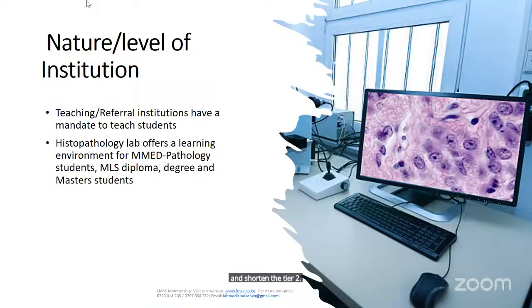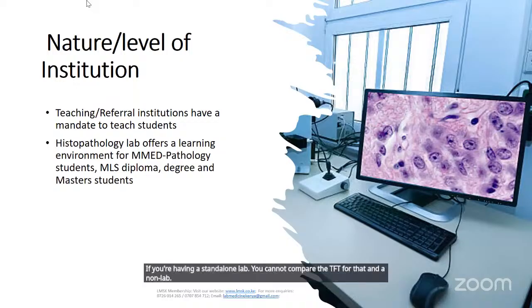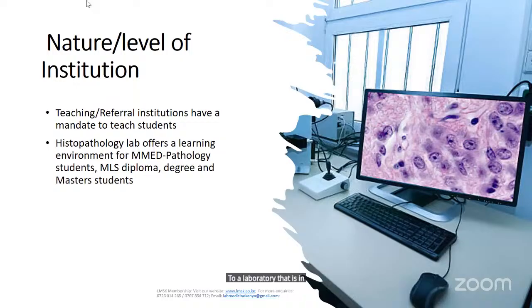Another thing that will affect turnaround time in a histology lab is the nature, the level, of the institution. If you're having a standalone lab, you cannot compare the TAT for that standalone lab to a laboratory that is in a teaching and referral institution.